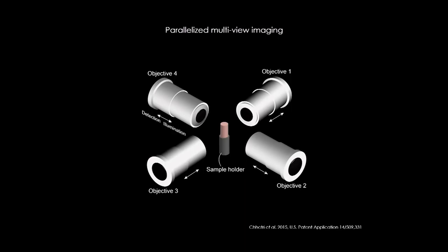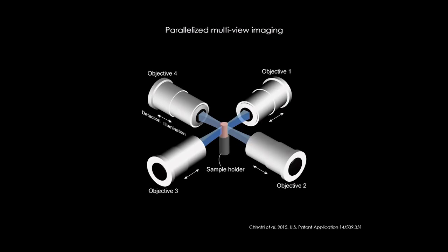But now the problem is, if we send in four light sheets at the same time, from all these four objectives, and then take four wide-field images of these objectives, we've violated the fundamental concept of the optical sectioning concept in light sheet microscopy. So we've actually sent in light in a way that we now illuminate out of focus structures with respect to the respective other light sheets. So we get out of focus light, we basically degrade image quality by doing this at the same time.